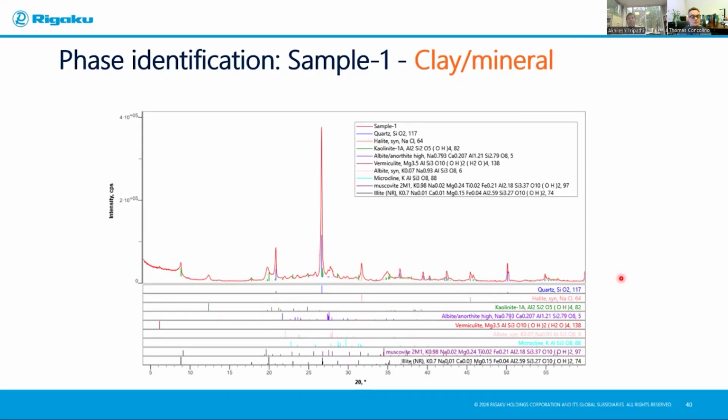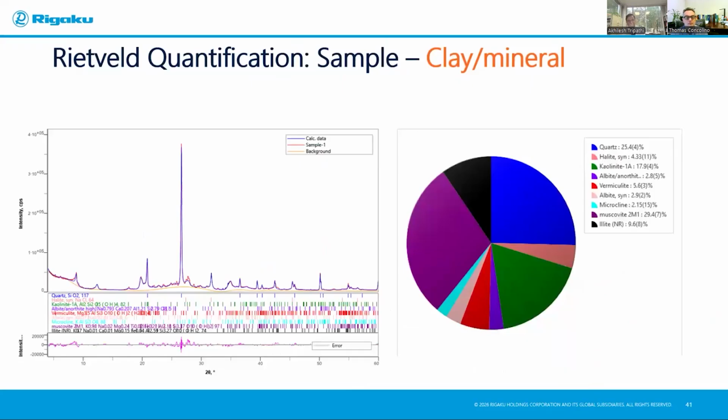And with some practice, you pretty much start doing the right phase analysis, and then you will go and perform a Rietveld, employing the right tools, such as when to refine which one, preferred orientation, and you would get the full results. So quite a task done by Rietveld to tell you the phases that are present. And like I said in the beginning, you can always create your own mixtures to ensure that you are using this software in the optimal way.